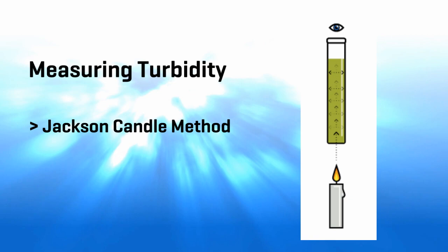And quite simply, it is a tube with increments on it, and it's on a sliding stand. And at the bottom of the stand, there's a spot for a candle. And you light the candle, fill the tube up with your sample, look down through the tube and move it up and down the stand until you can't see the candle anymore. And when you get to the point that you can no longer see the candle, you look on the side and then the increments are there and it tells you how turbid the water is.